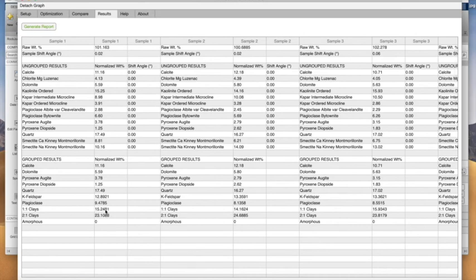I have 1:1 phyllosilicate clays here, 15%, and that includes just kaolinite. It turns out there is 15% kaolinite in this mixture, so we are only 0.25% off on that. The 2:1 clays would include both the smectite and the chlorite, which I include under that heading.